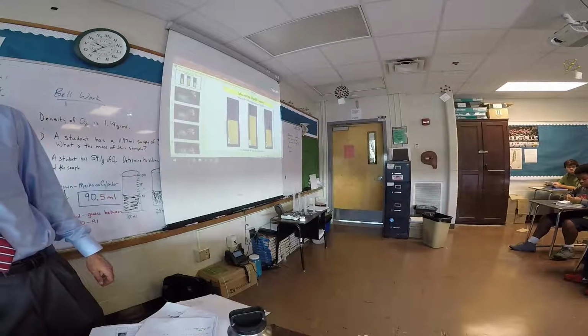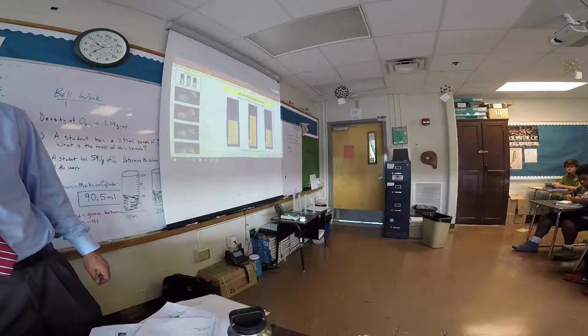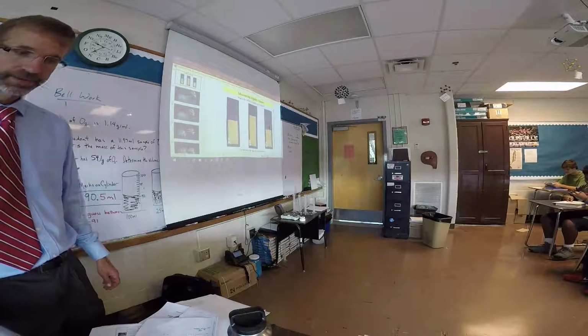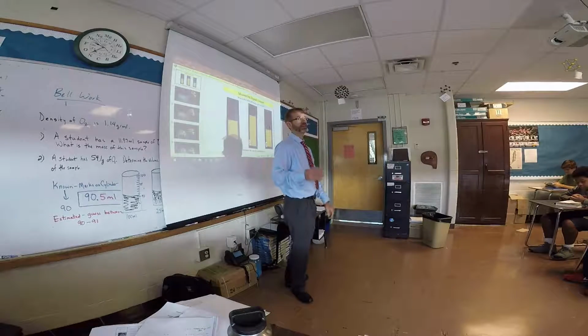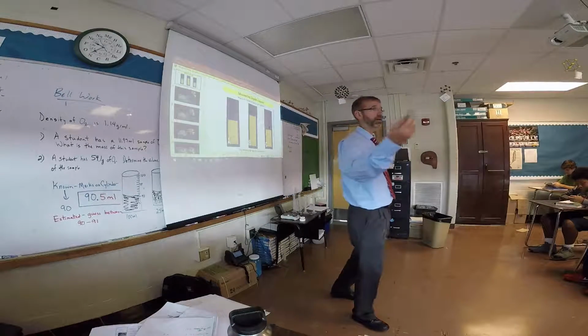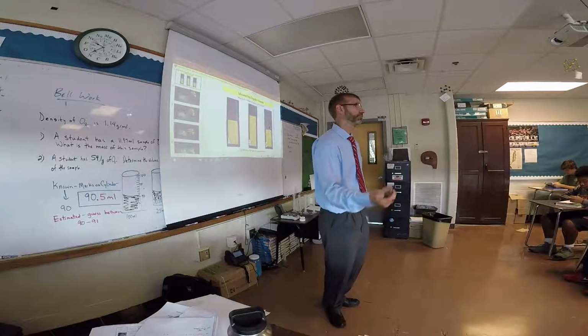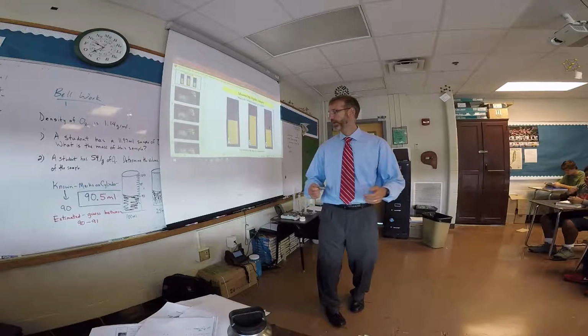Do a lab here on density. Now we're going to do it in this room because students tend to want to drop the metal objects in the sink and then they go into the drain, right? This will fall into the drain like such, and it's difficult to get out of the drain. You got to do the P-trap, so it's just a problem.